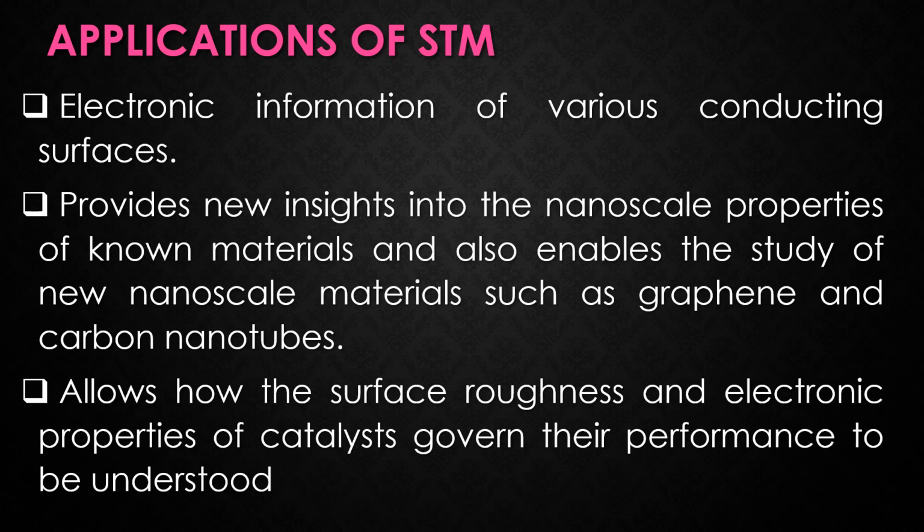And electronic information of various conductive surfaces can be determined by scanning tunneling microscopy. In material science, it provides new insights into the nanoscale properties of known materials and enables the study of new nanoscale materials such as graphene and carbon nanotubes, as well as assembling structures composed of individual atoms.